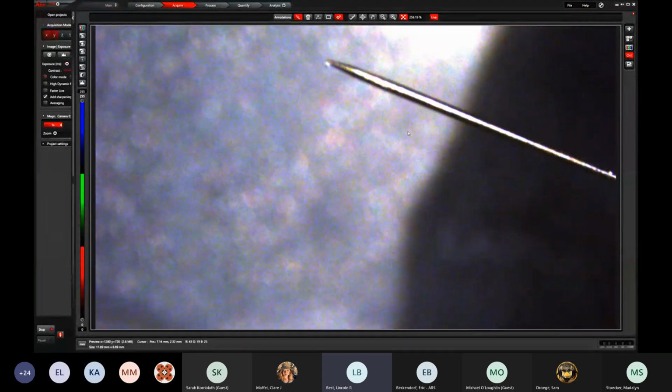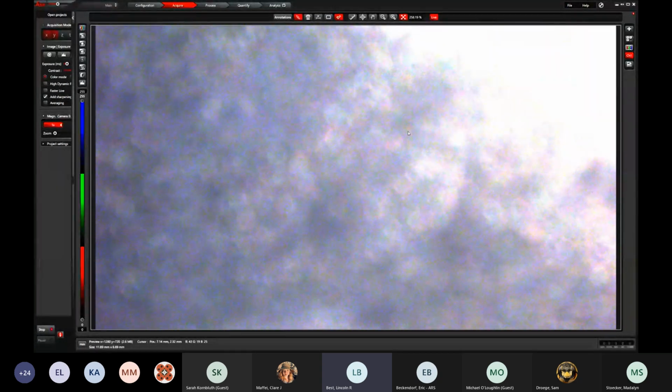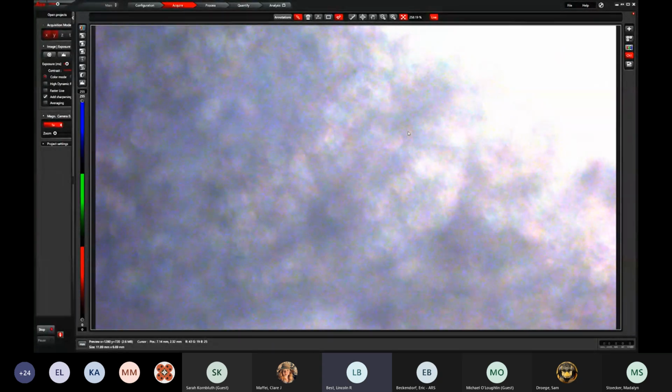And so I'll just provide a demonstration here of how you can pop your male bumblebee genitalia out. You'll have to maybe just give me some guidance as we go, because I'll not be able to assess the quality super well as I'm doing this.